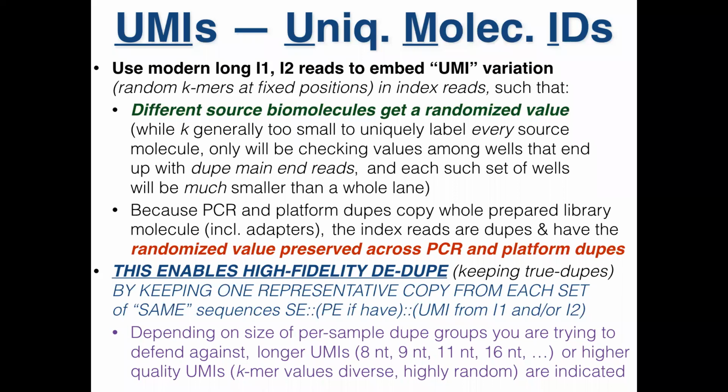But that's what we do. We'll use the uncommitted extra index bases that we don't necessarily need, and we will randomize them with Ns. Then when you put them on your library, on your starting material, essentially that uniquely marks each molecule for your biosynthesis right at the beginning.